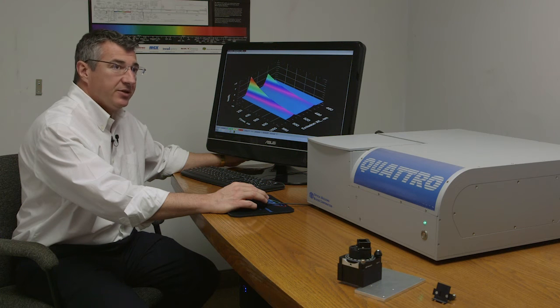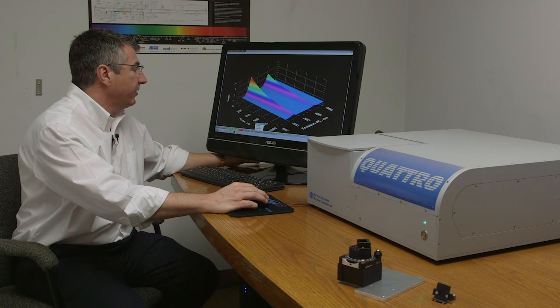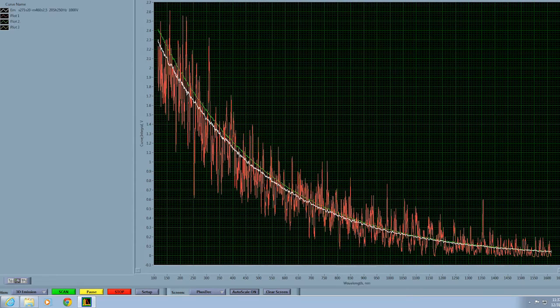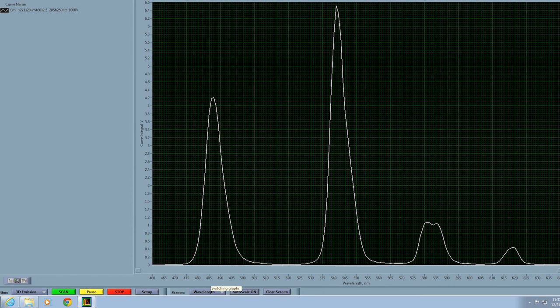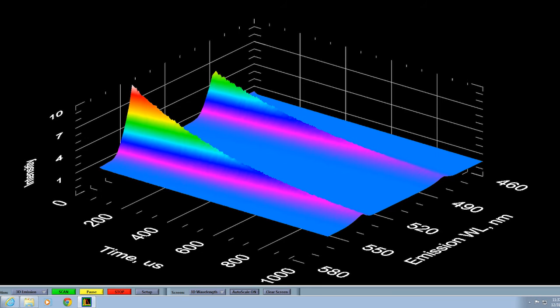So having collected a variety of different types of data sets for this particular sample, we can still, the software retains all of the information and all of that data. So we can again select phosphorescence decay, look at the time-based decay curves that we had collected earlier, we can also look at emission wavelengths, the spectra that we've collected are still there, and also the three-dimensional mappings.